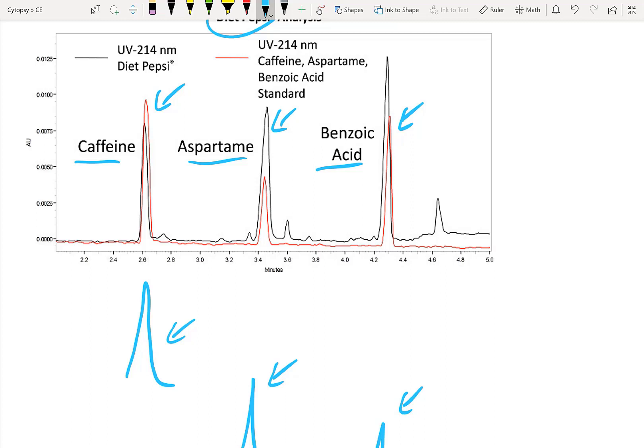One thing I didn't mention before is that each of these peaks, the area under the curve actually corresponds to the concentration of that component inside the solution. And within this JOVE article, they actually show you how to make a standard curve and how to analyze the concentration of each component within your sample.